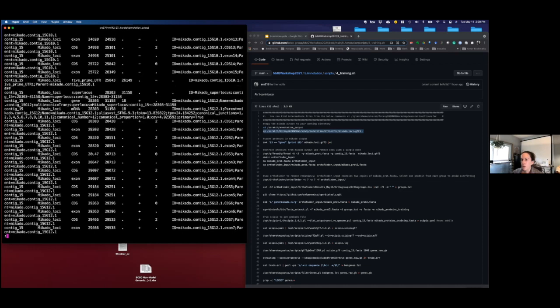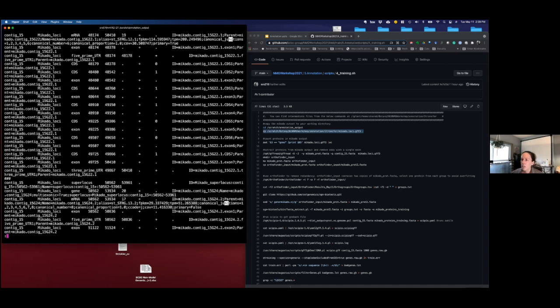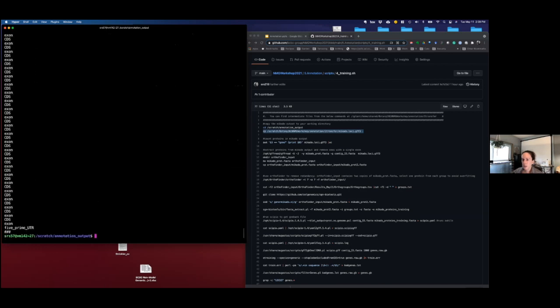Oh, one thing, so that business with Uniprot, whenever we were looking at the Mikado script, it's actually assigning things as genes that had matches to Uniprot. But if you go through here, I think there's non-coding RNAs or something. I'm not seeing it here. Let's do this. cut -f3 Mikado and sort. So all I did was I took the third column and I just wanted to see all the unique things that are in there. Yeah, here we go. This is what I was looking for.